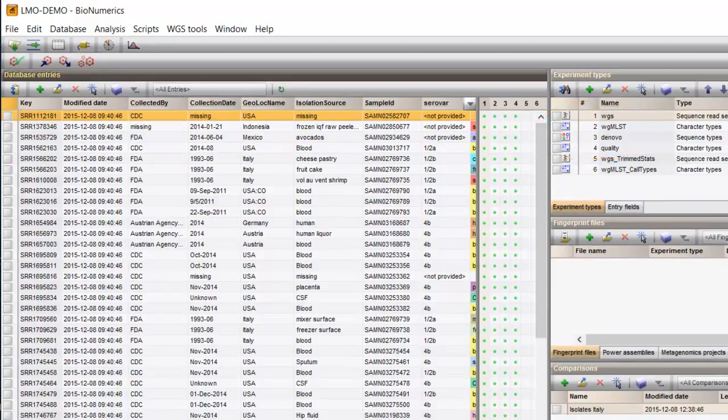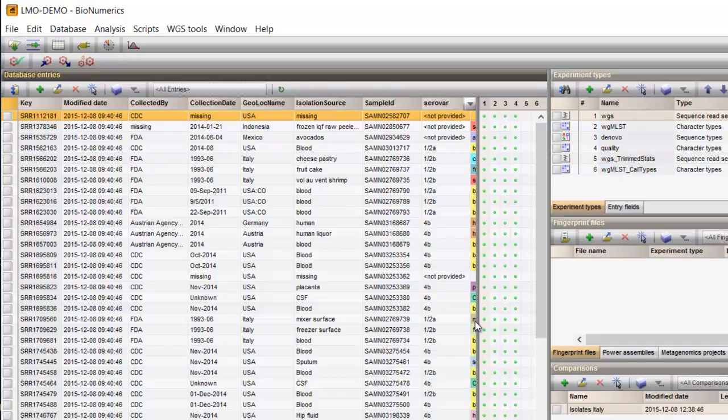Once you have the Whole Genome Sequence Tools plugin installed and have entered the correct settings for your calculation engine, performing an allele calling process is quite straightforward. Read sets may, but don't necessarily need to be imported in your Bionumerics database.